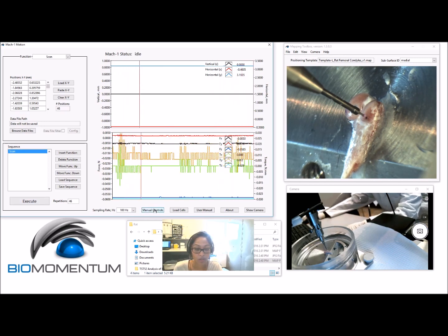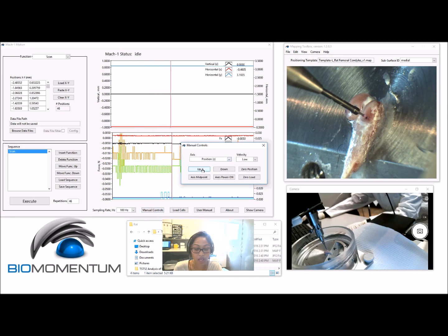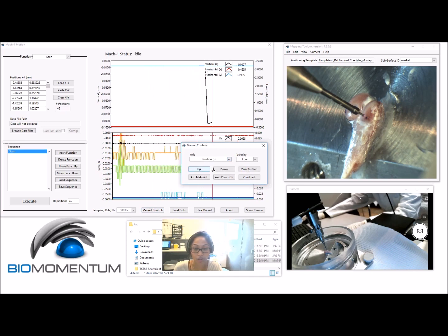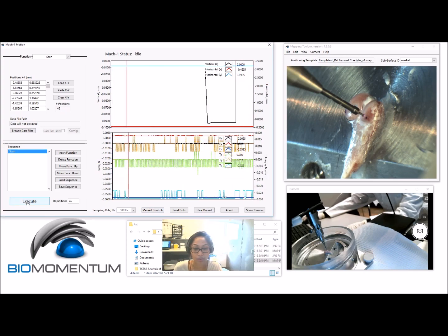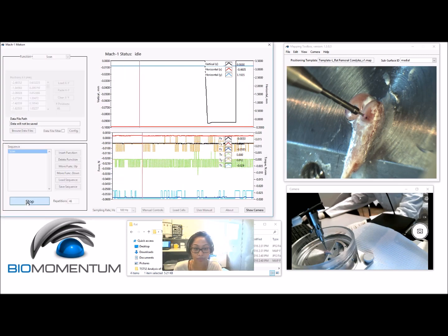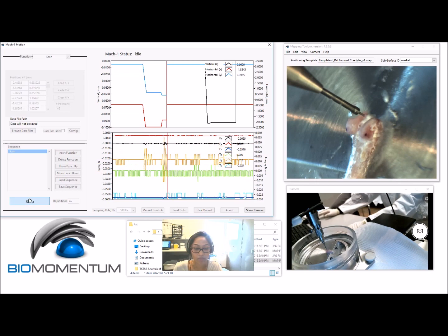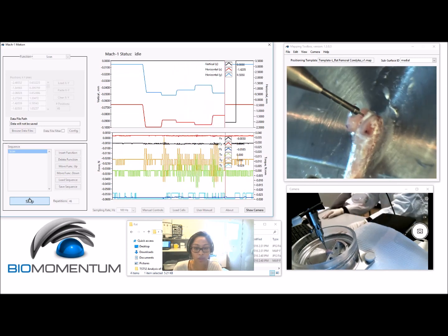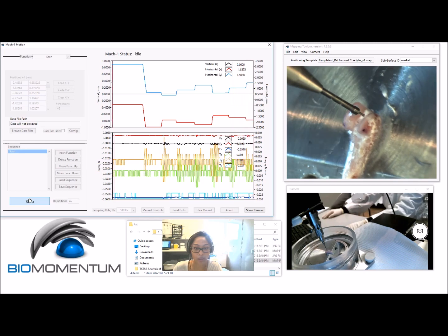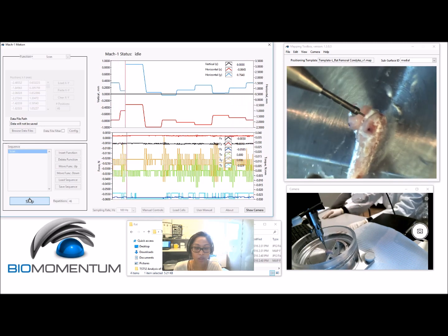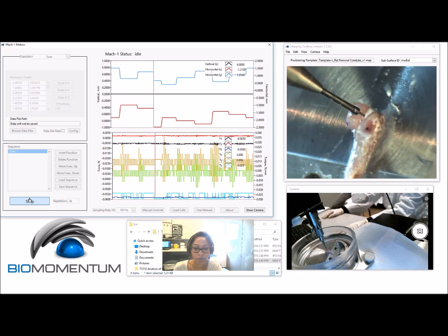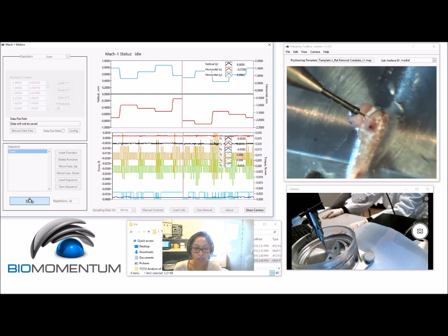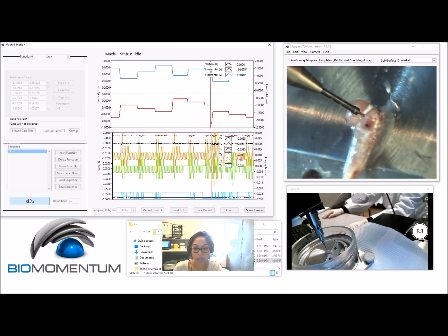It is important to ensure that the indenter is positioned at 2 mm over the highest point of the sample before pressing Execute. This step verifies that the indenter clears the sample surface everywhere in the X and Y scanning area. Failure to properly perform this verification might irreversibly damage the load cell.